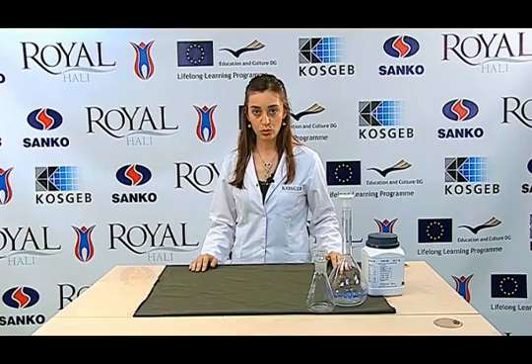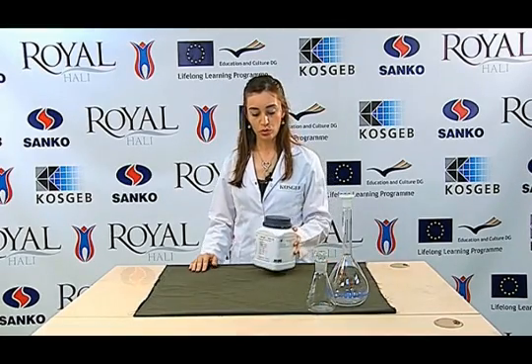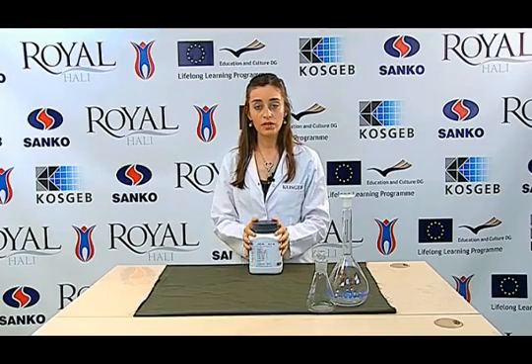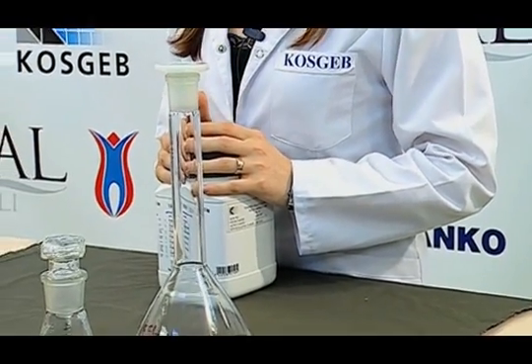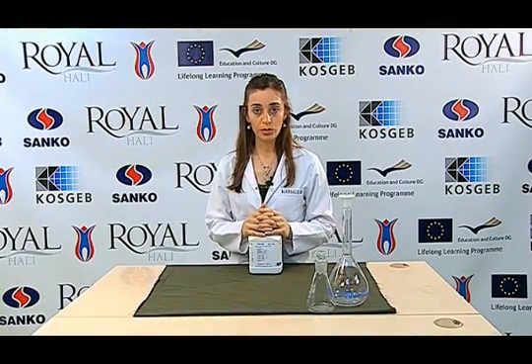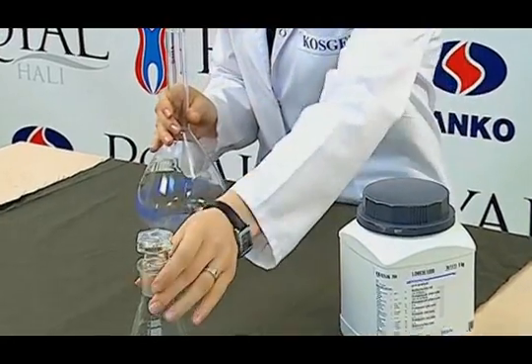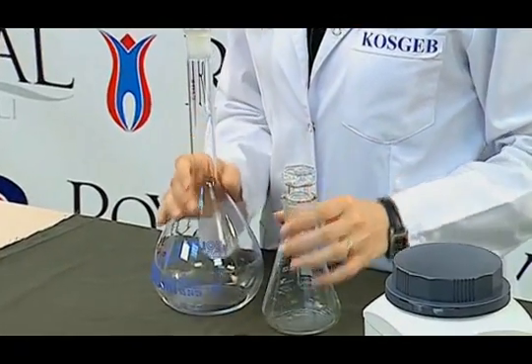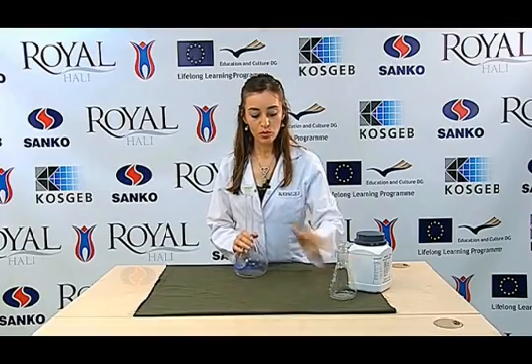During the progress of our test, we use a mechanical shaker. Besides this, we use potassium chloride solution at 0.1 molarity. We use a precision balance, a pH meter and buffer solutions for the calibration of the pH meter. Various glass materials for the preparation of our solutions are used. The samples are shaken and we use distilled water in the preparation of the solutions.